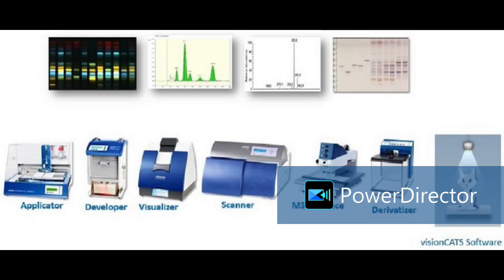All these four different kinds of separation applications we can perform. In the traditional way, we can apply bands at the bottom. We can also apply a band in the middle of the plate. One long thin band we can apply for preparative isolation of compounds, micro preparative work. And superimposed application we can do on the plate for spiking studies also.